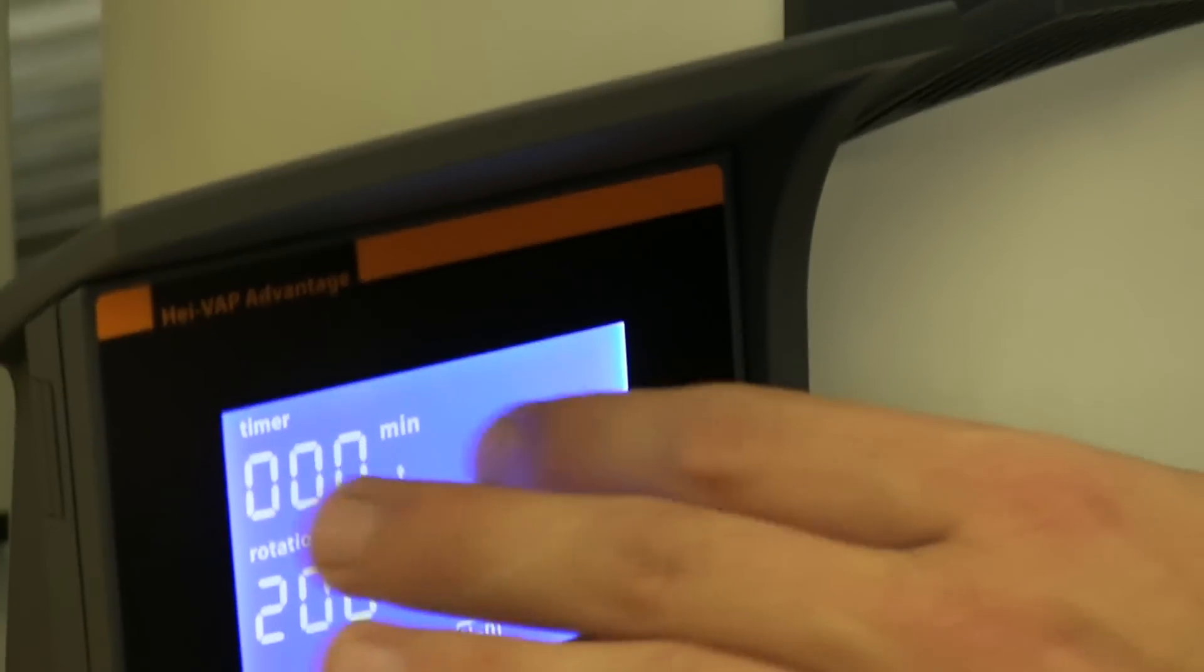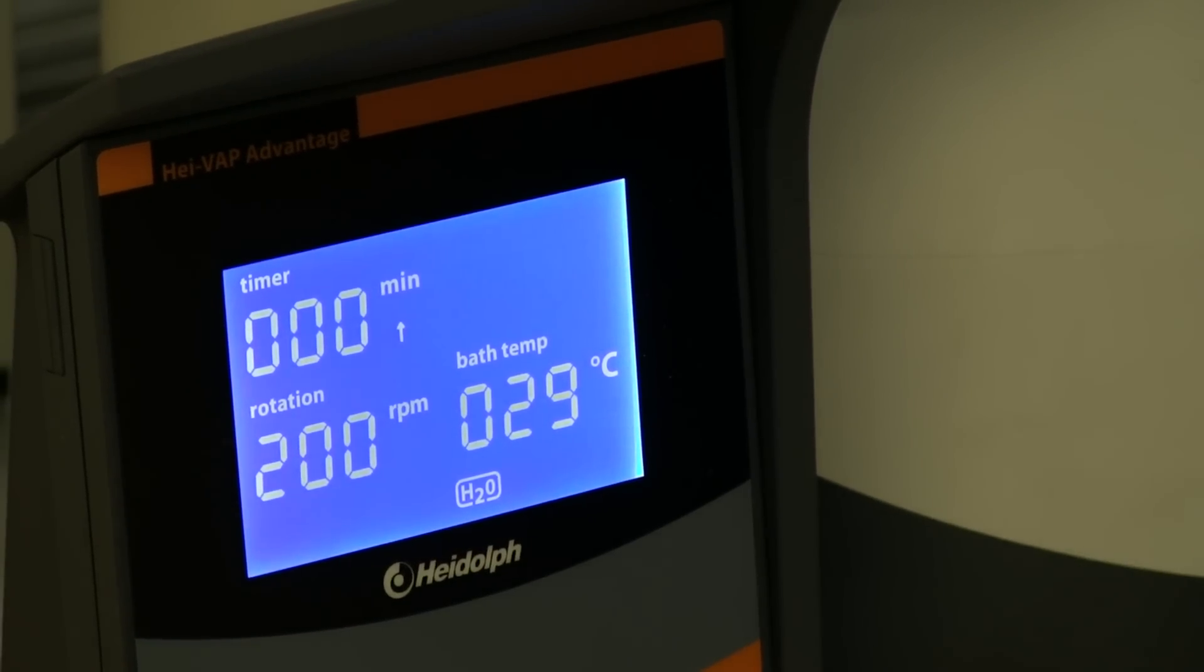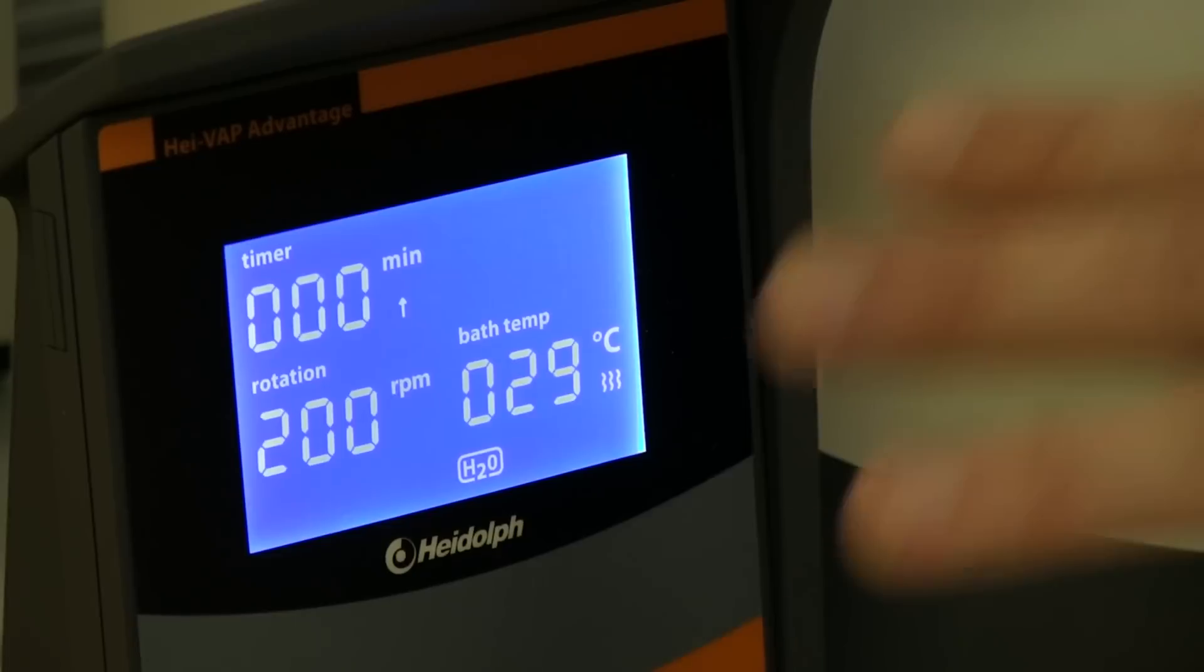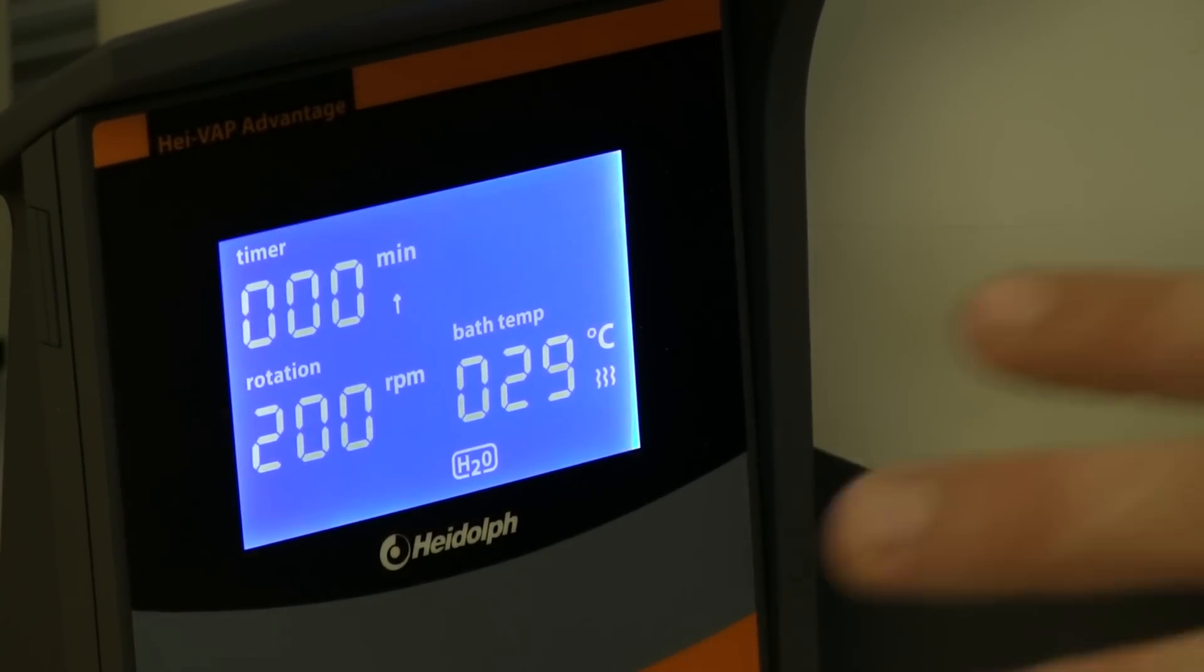We have a timer that if you'd like to have this timed, if you're going to walk away from it and you want to make sure that the whole process doesn't get too far, you can set a timer and the machine will actually stop. We'll still pull vacuum so it's best to not go too far.